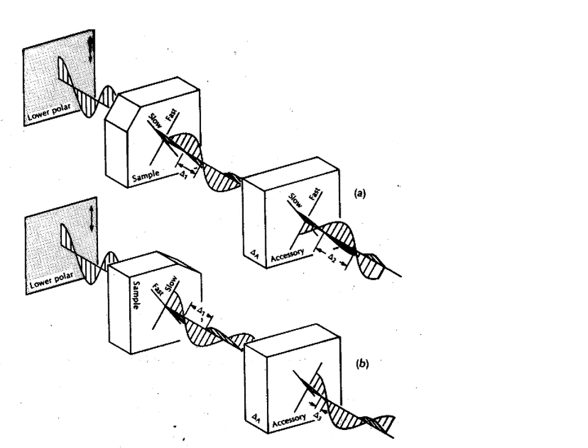Now, the plate is a permanent mount. It can only be inserted one way, so it's always going to have the slow ray in the upper left. So, slow ray in the upper left on the mineral, slow ray on the upper left on our accessory plate. That means that the same light ray that had already lagged behind now is forced to lag behind even more, and the retardation of the two rays increases, and a higher order interference color is observed.